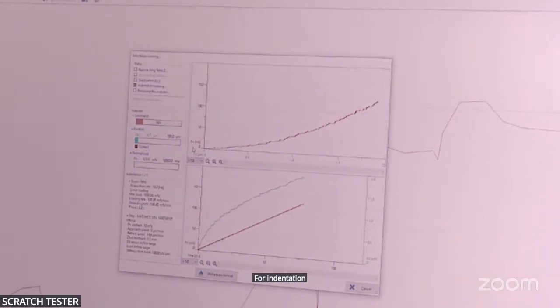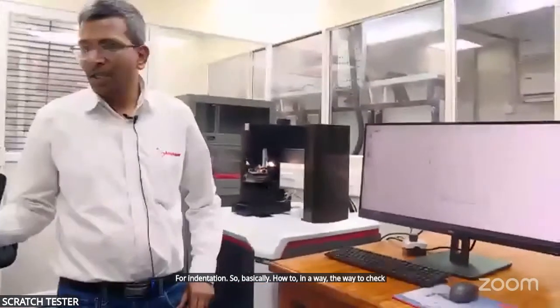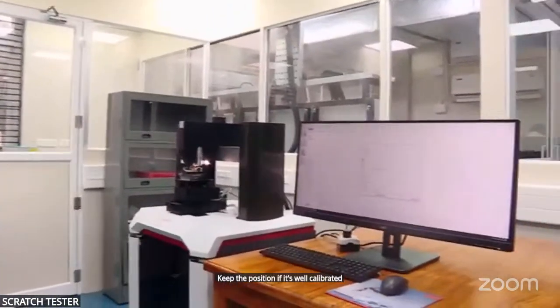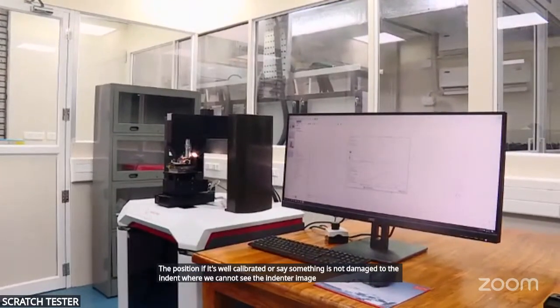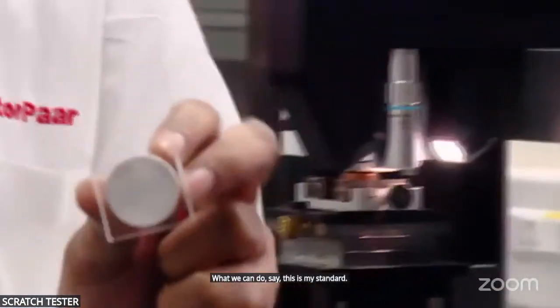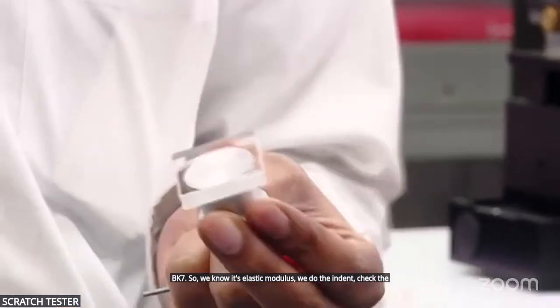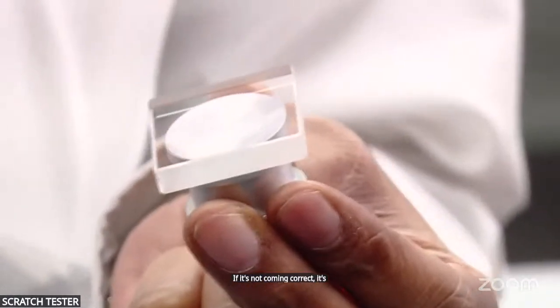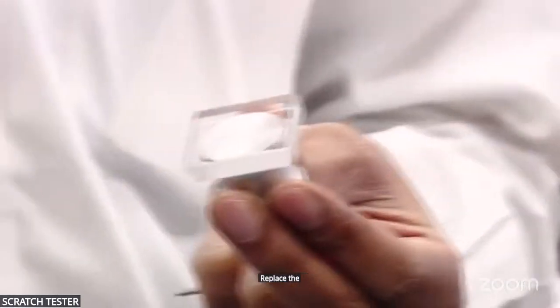So in this way we get to know the exact surface area and then we proceed for indentation. Basically, the way to check my indenter position, if it's well calibrated or if something is damaged on the indenter where we cannot see the indenter image also, is this: say this is my standard BK7. We know its elastic modulus, we do the indent, and check if the elastic modulus is coming correct or not. If it's not coming correct, it's way off. One reason could be my indenter is damaged and I need to replace it. That is a very easy way to do it.